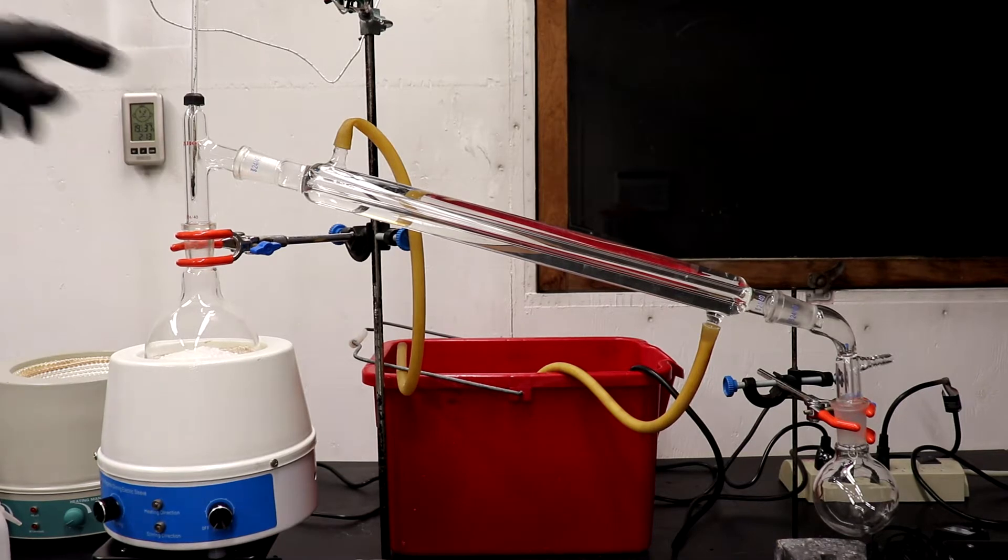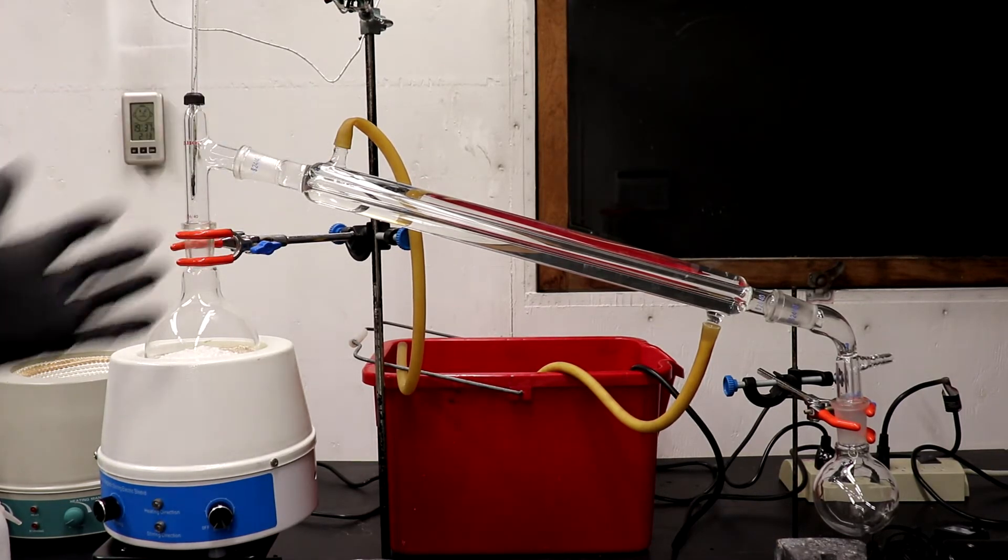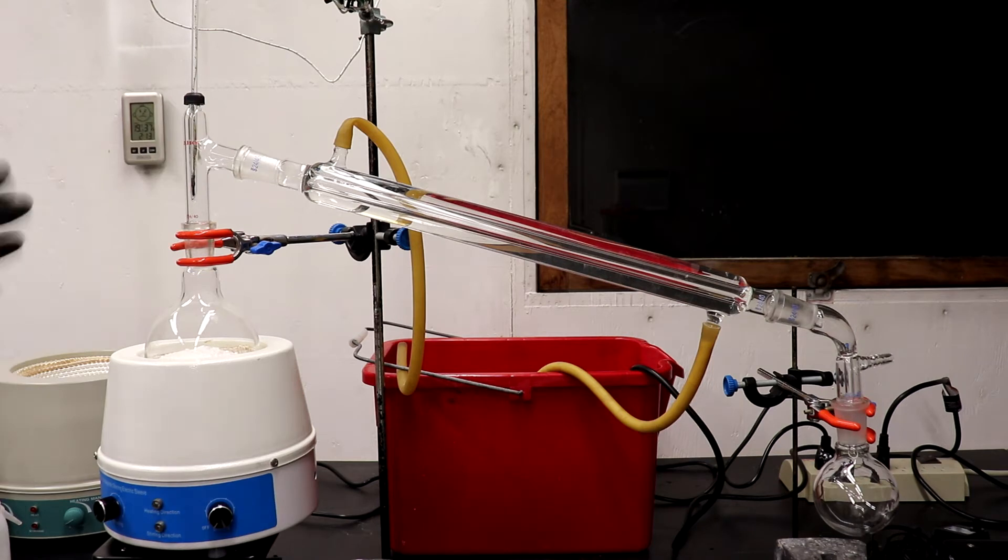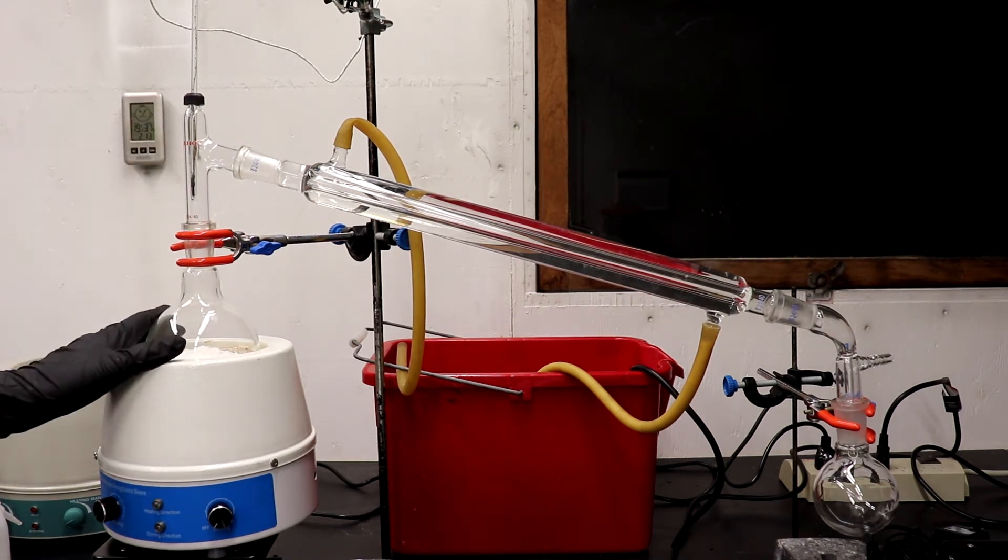Now the 40cm Liebig I'm using here is definitely excessive since aniline boils at 184 degrees Celsius, you really don't need much to condense it. So I could have gone away with using a smaller Liebig, but my other ones are dirty so this is what I have.